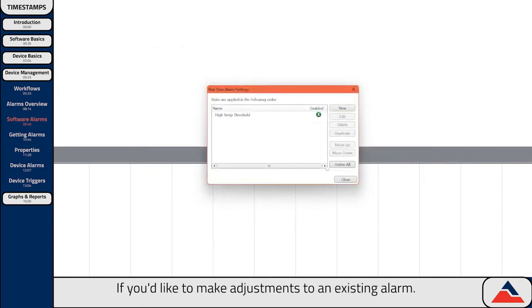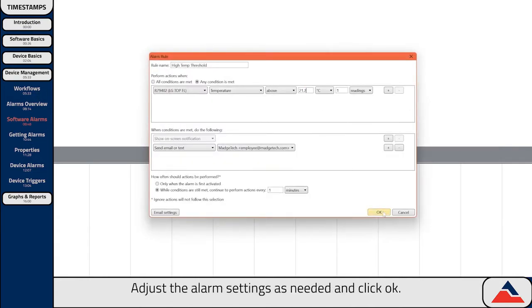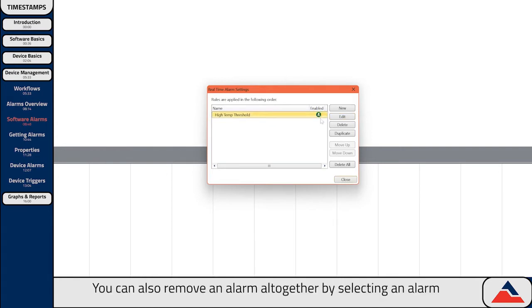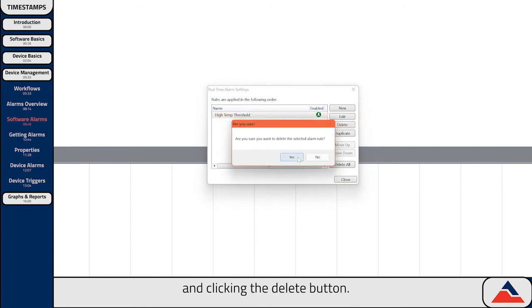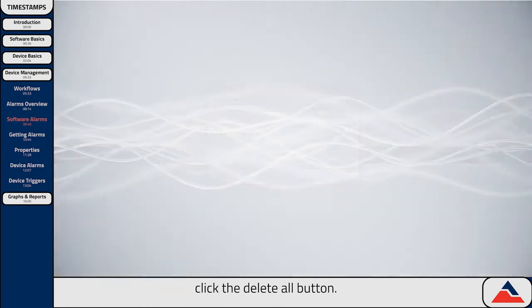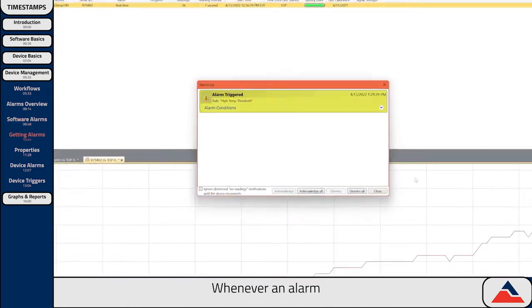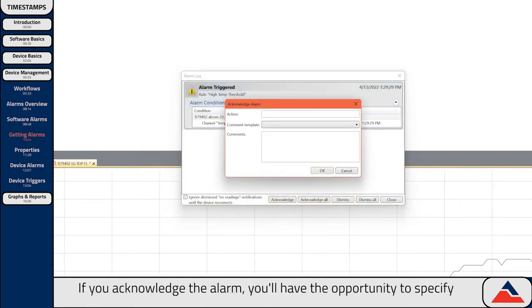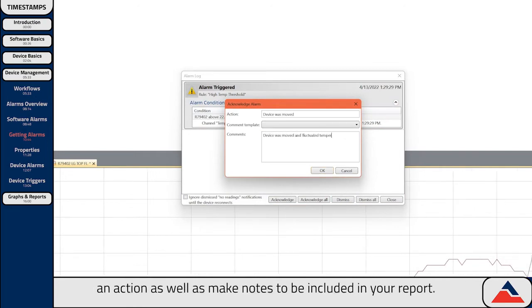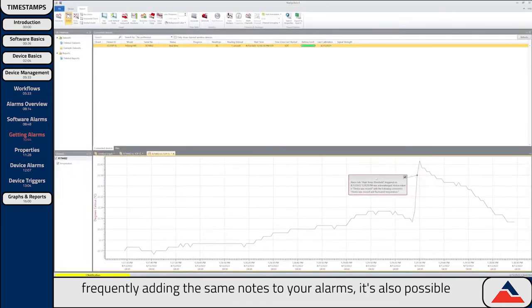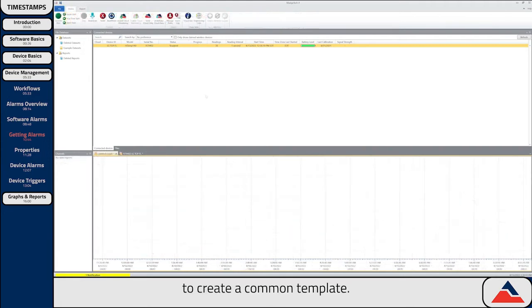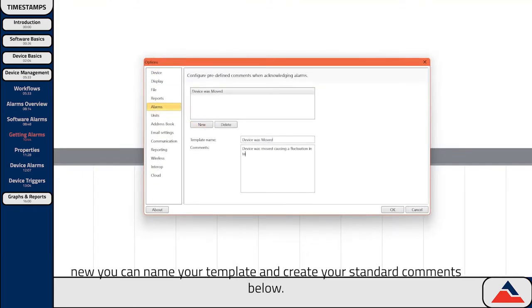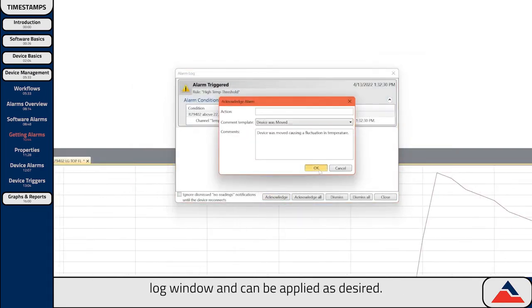If you'd like to make adjustments to an existing alarm, first select the alarm you'd like to change and then click the edit button. Adjust the alarm settings as needed and click OK. Enabling and disabling your alarms is as simple as selecting the icon to the right of the listed alarms — red means disabled, green means enabled. You can also remove an alarm altogether by selecting an alarm and clicking the delete button, or click Delete All to remove all alarms. If you find yourself frequently adding the same notes to your alarms, it's also possible to create a comment template. To do so, go to the file tab, click Options, select Alarms, and click New. Name your template, create your standard comments, then click OK. The predefined templates will now be available in the alarm log window.